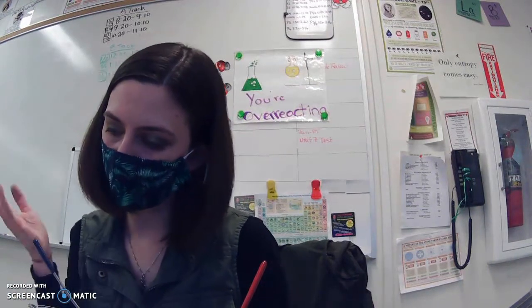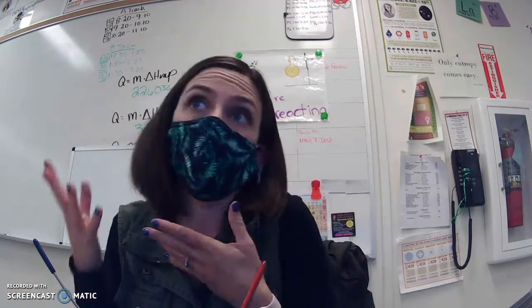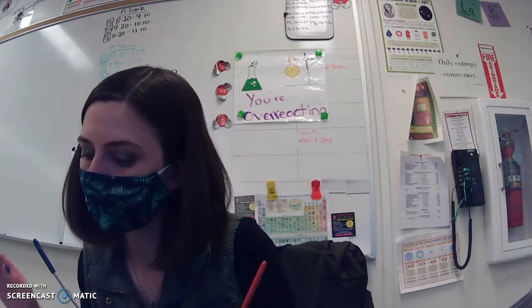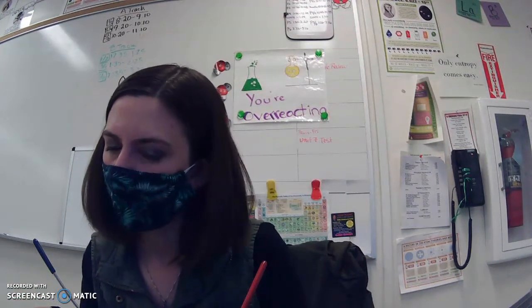After watching the video, so you're going to watch a video and see why the soap cleans the oil. Is it polarity? What properties does it have that make it do that? And lastly, we're going to look at a river water sample in the fourth beaker.